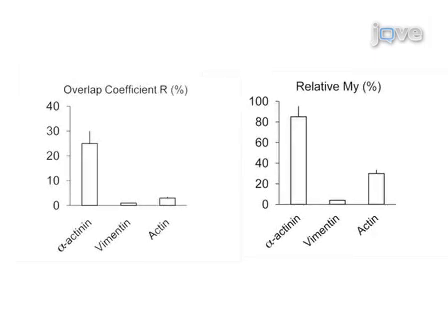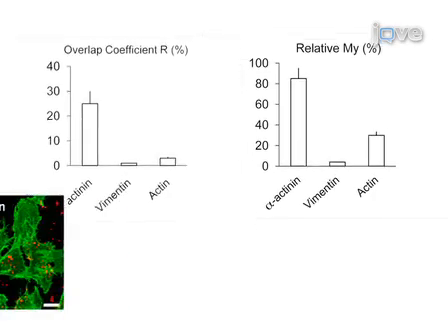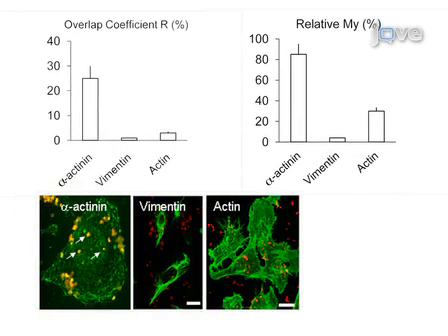Overall, in HbMEC infected with OPC expressing meningococci, greater than 25% overlap of α-actinin and meningococci was obtained. The coefficient MY is a measure of the frequency of occurrence of the more abundant α-actinin signal each time the less abundant meningococcal signal occurs. This measure shows a striking level of occurrence of α-actinin in the vicinity of internalized meningococci.